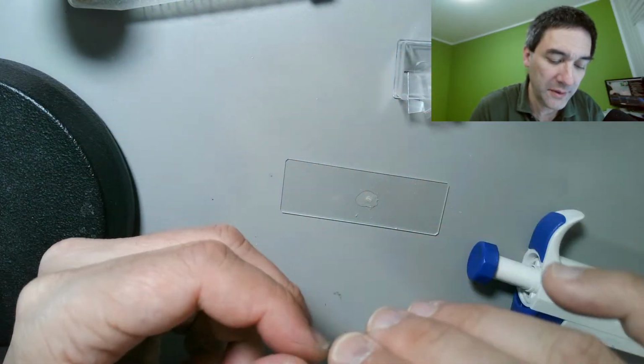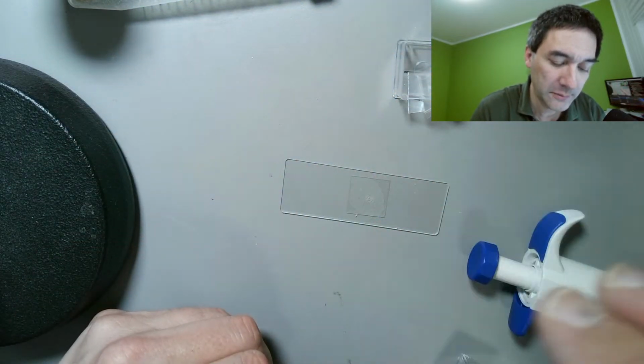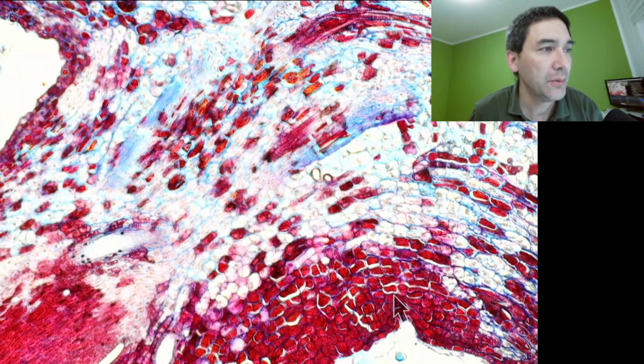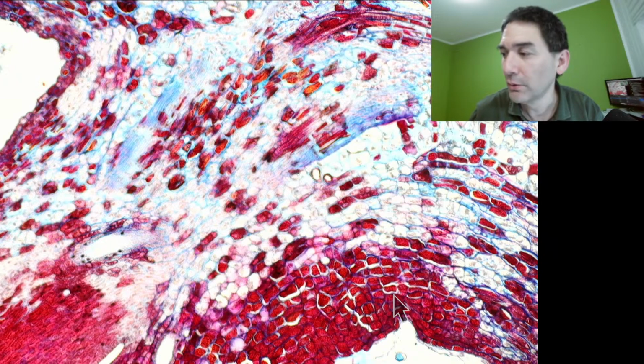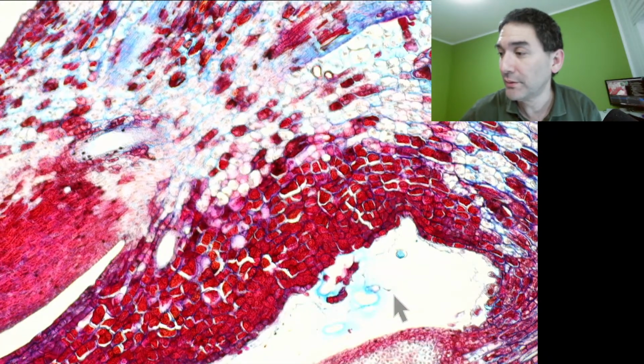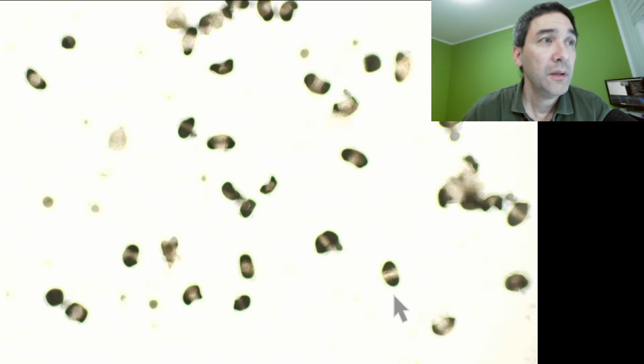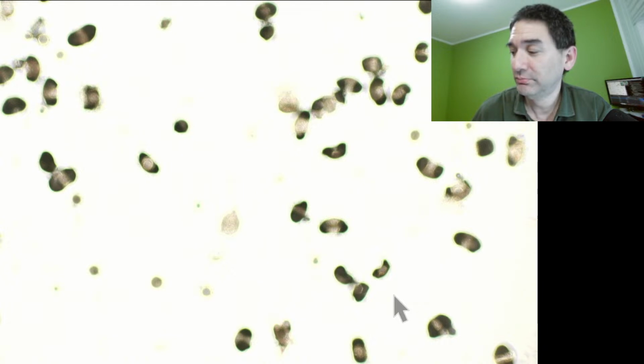Just going to drop this on here. And now we have another look at, no, not this one here. No, that's the one. That's the correct one. Okay, let's remove this. And that's what I got.